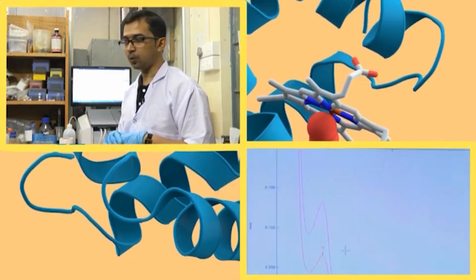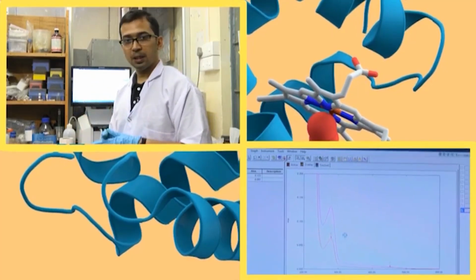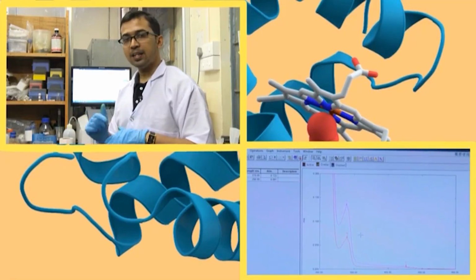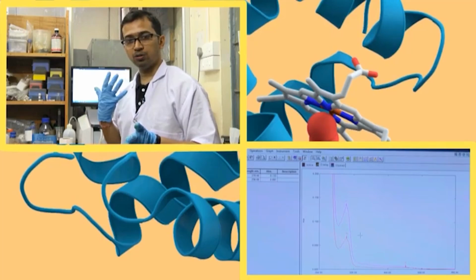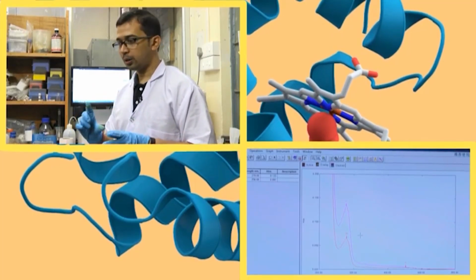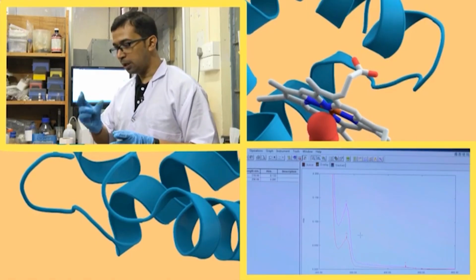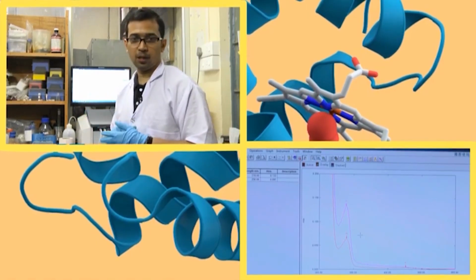What was actually happening out there? Curcumin sometimes precipitates in this aqueous medium. So, when we are adding HSA, the desired amount of curcumin is not coming into the aqueous solution in which HSA is dissolved. In order to do that, we have to forcefully bring it into the solution by mixing it in an up and down method.